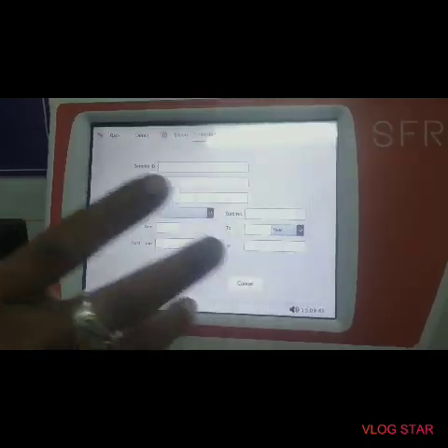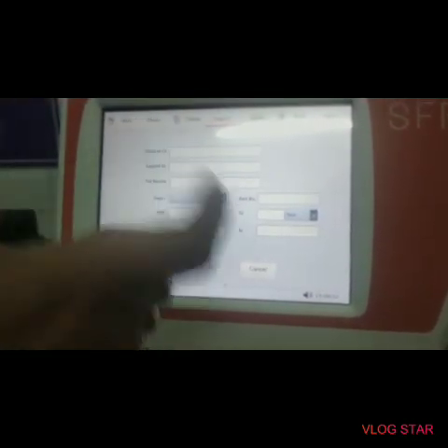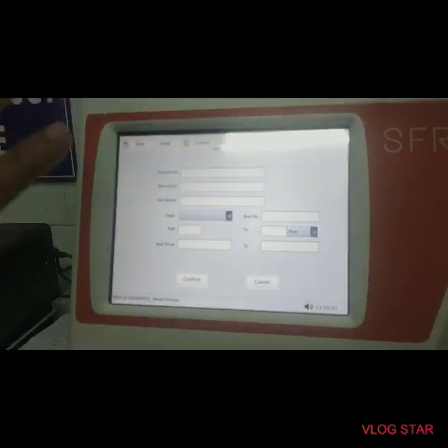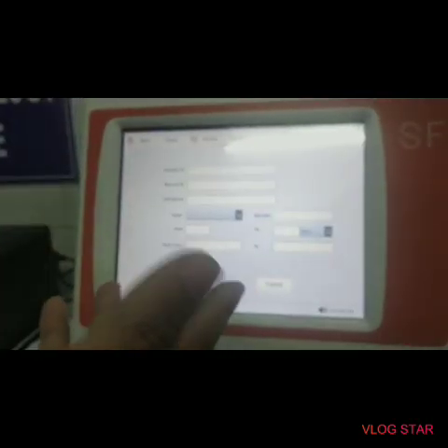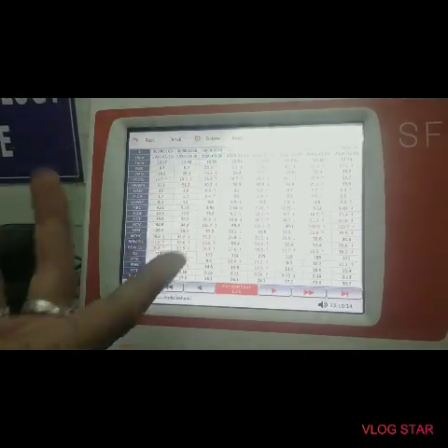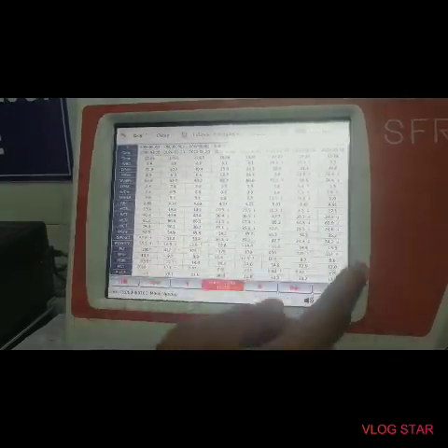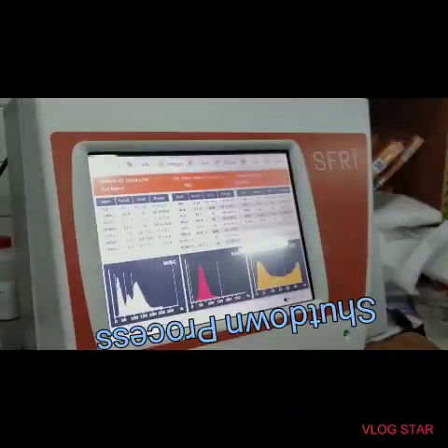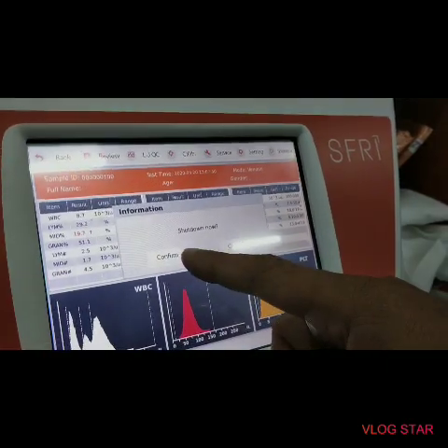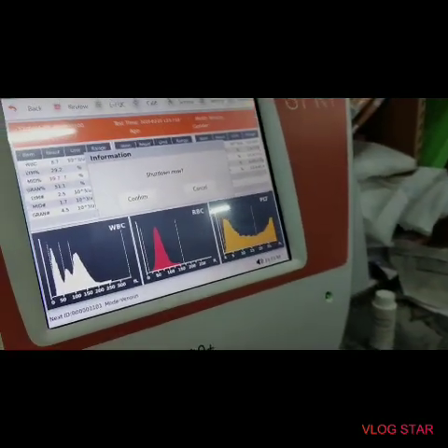We have to see this. In Inquiry, we have to see day-to-day, like test time from 2. It is not possible that we have data in our InfoStorm; we have data-wise. Whereas sample ID, we have to see the date. Data is automatically created. We have to see how the data is created — data automatically has the data, then the sample is created. Data automatically changes. Thank you.